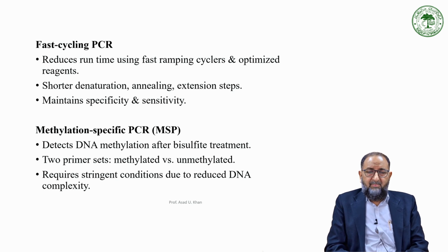Sometimes you can reduce the runtime. It also depends on the size of the gene and the processivity of the Taq polymerase, or Vent or Pfu, or any kind of polymerase which is used for the PCR.